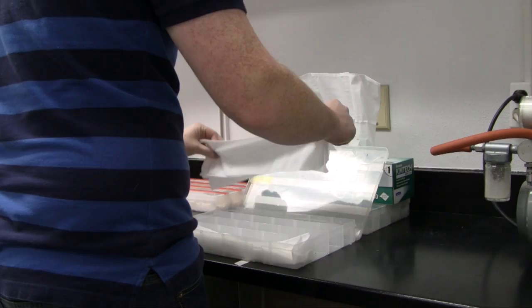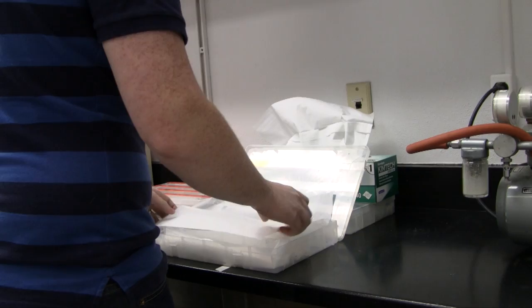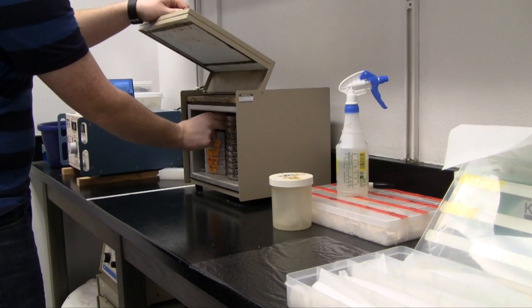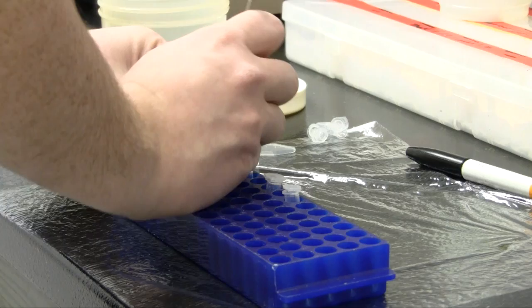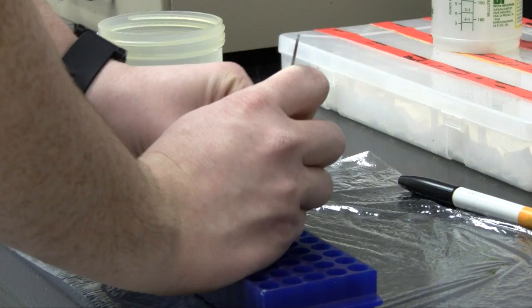Seeds can be germinated in a variety of media, peat-based, vermiculite, or on moist Kimwipes or paper towels in a tackle box. Seeds are germinated in a growth chamber a few days before starting the FISH method. To perform the FISH procedure, root cell division must be stopped at metaphase. To accomplish this, roots are subjected to high-pressure nitrous oxide for several hours. Roots need to be placed in a suitable environment during the treatment.